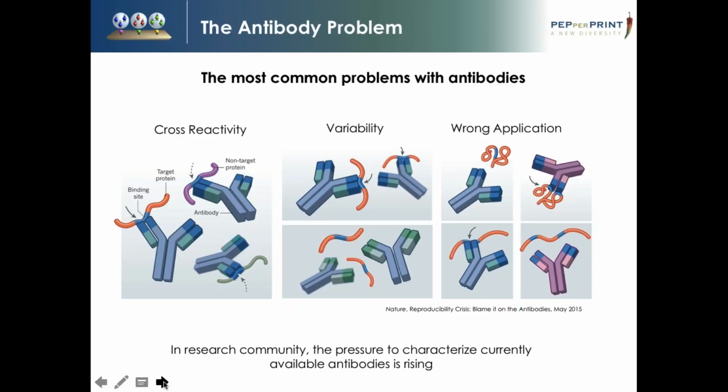He really wanted to emphasize to the research community that it's not worth compromising the integrity of your experiments, and to validate your antibodies.